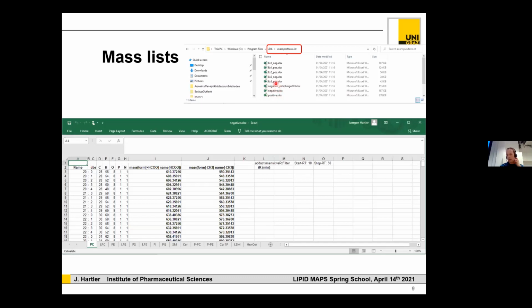Here I have to mention the extension for the sphingolipids that Ed mentioned yesterday. The negative and the positive are designed for the platforms where we already made this extension. This is currently the Velos Pro and part of the Q Exactive. For the other platforms, please use negative underscore no sphingoOH, and positive underscore no sphingoOH. I will show you in this slide what is the difference between both of them.